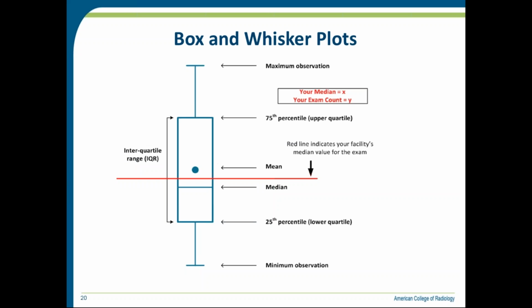So this is a box and whisker plot, and we need to understand that because in this PDF report and also executive summary report, we use this extensively. And once we understand this, the understanding of DIR report becomes very natural. And this is also very easy to understand. You can see this is a box and whisker plot. It is called so because it has a box and 2 whiskers.